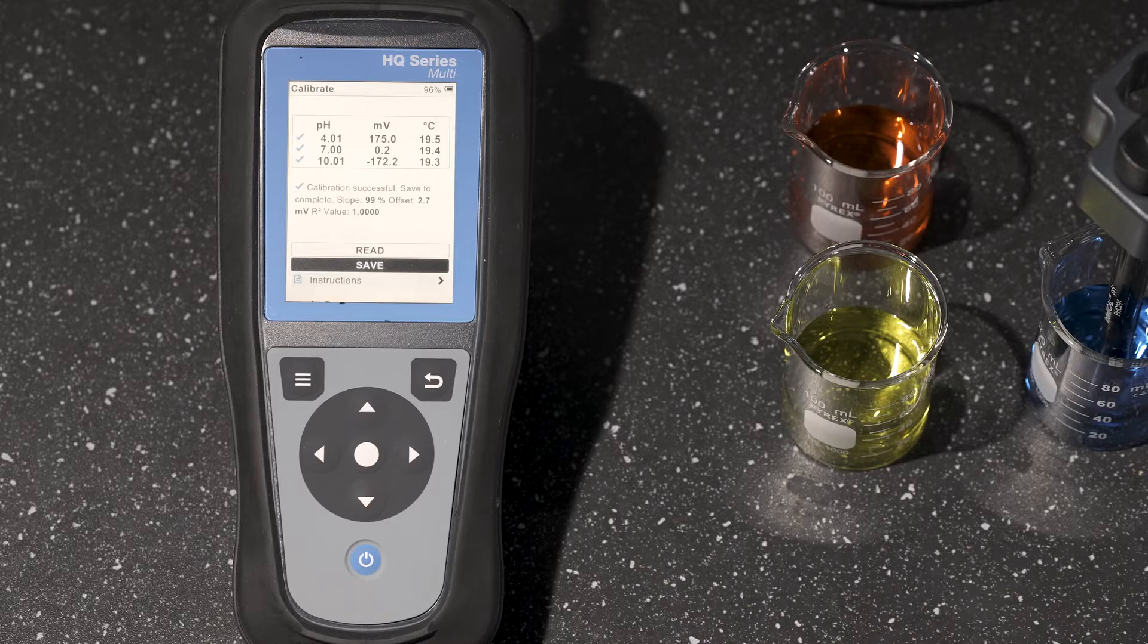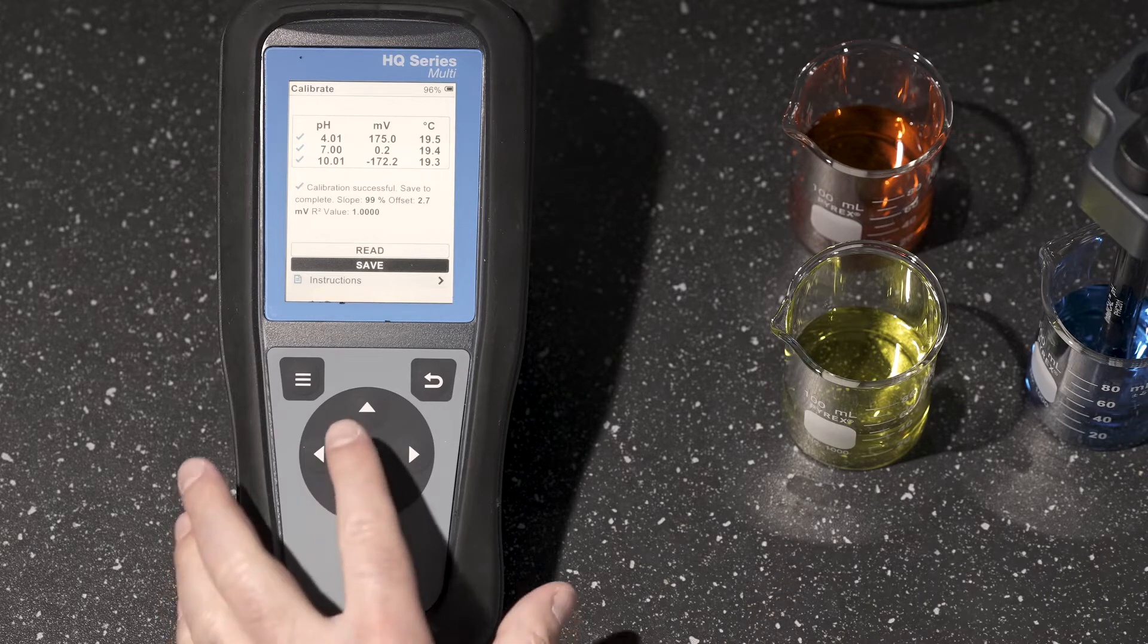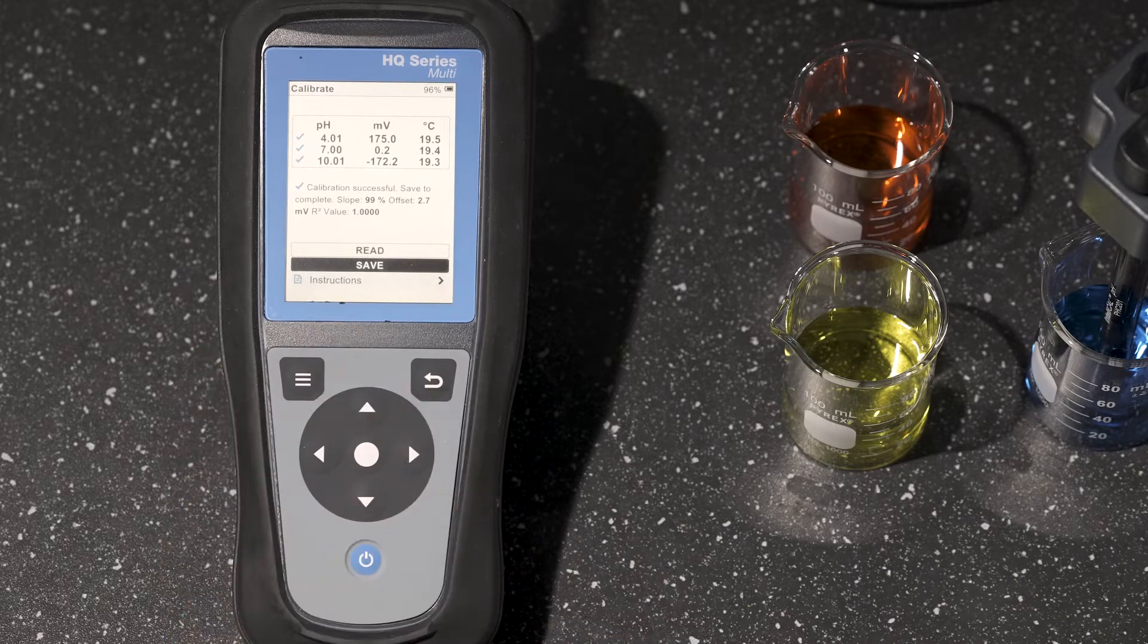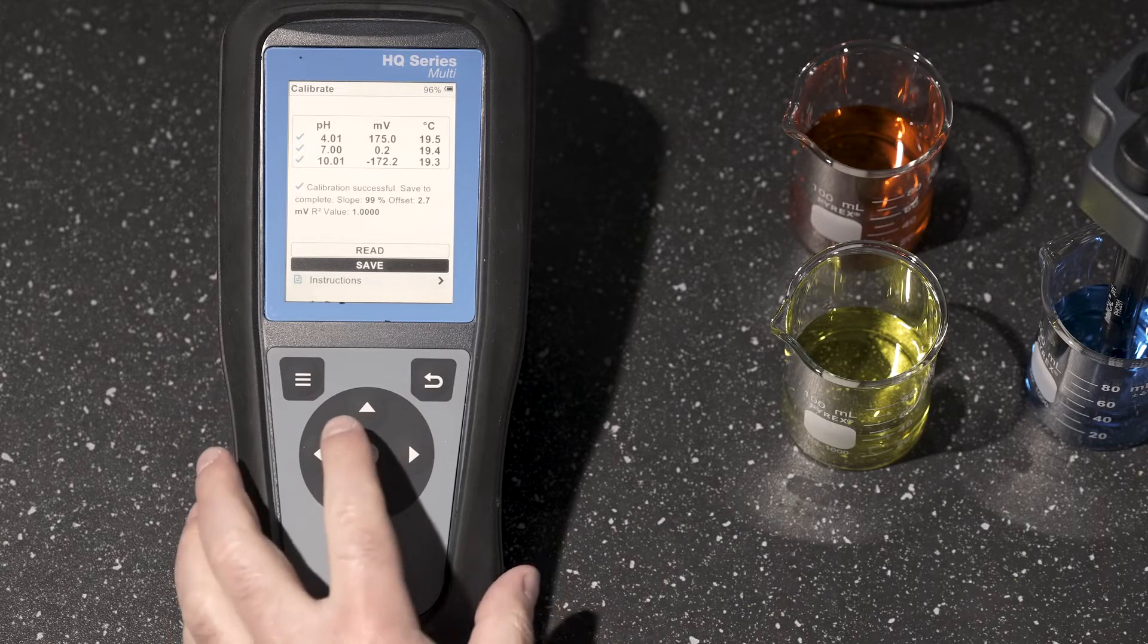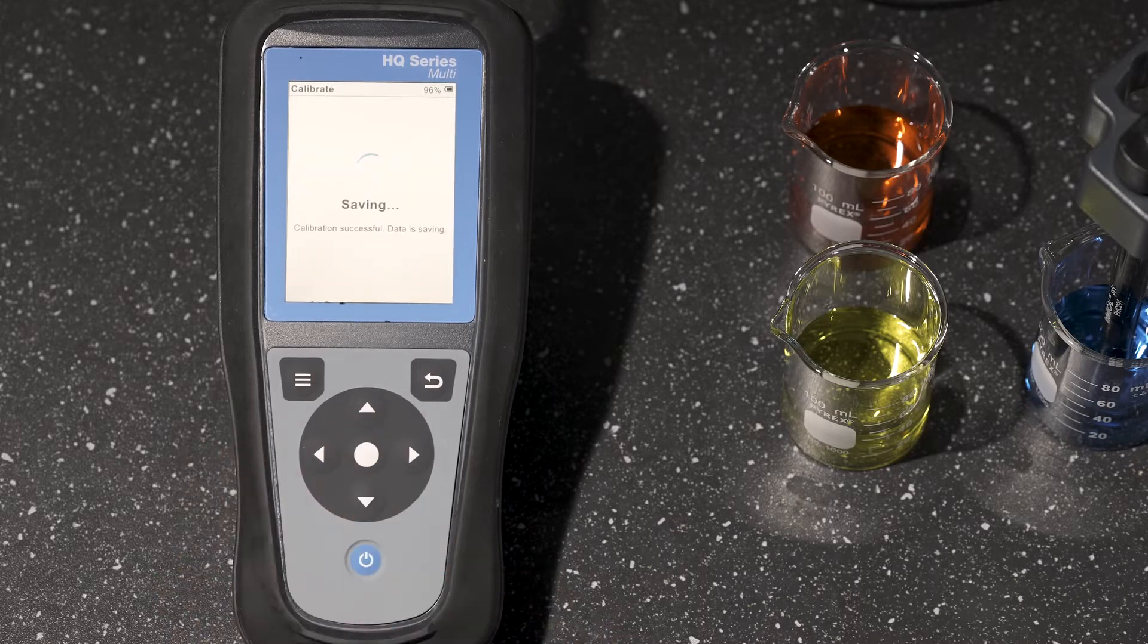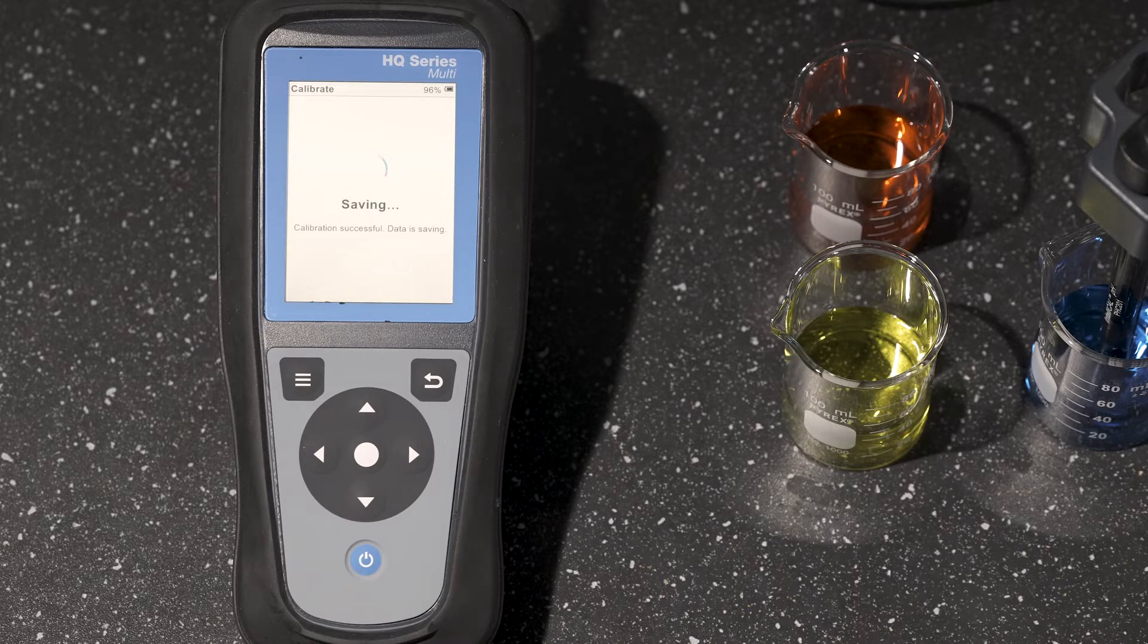There we can see calibration was successful. I can then choose to go ahead and save this. You'll also note the slope and offset is also indicated. After I choose save, there'll be a brief thinking window and then we're ready to begin measurement.